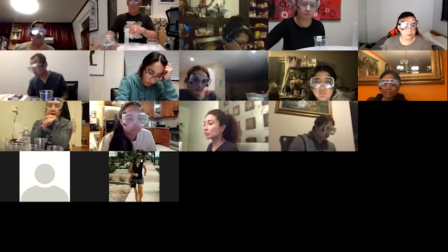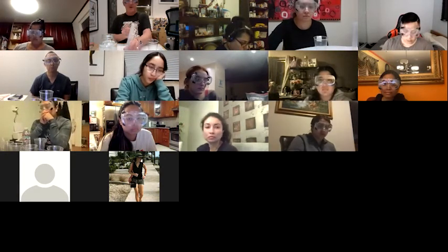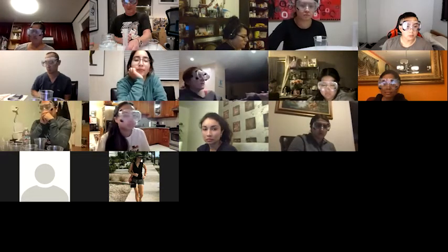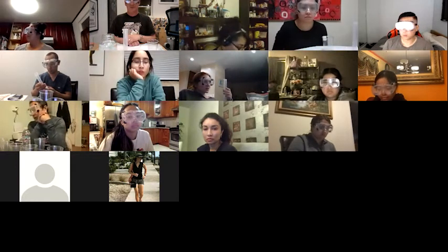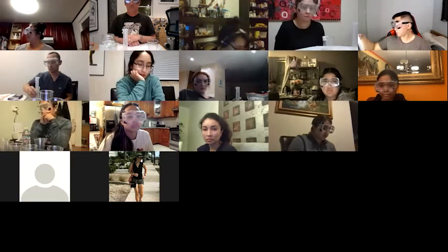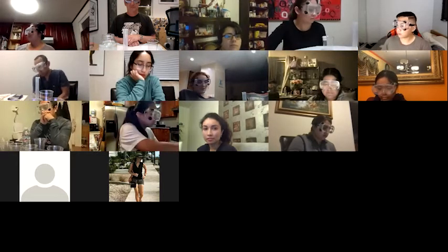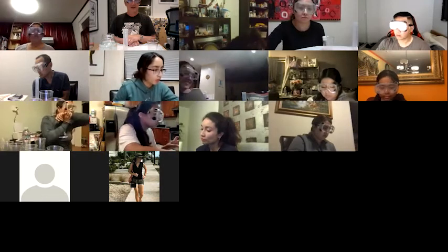So what volume of water can I measure in my graduated cylinder that I know is going to be pretty close to 50 grams? What do you think?